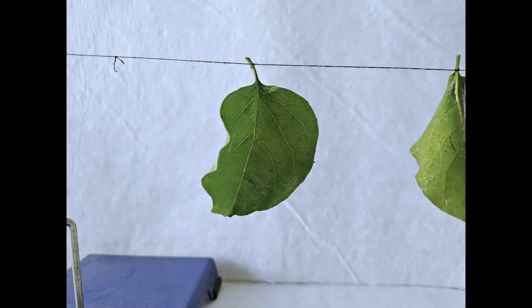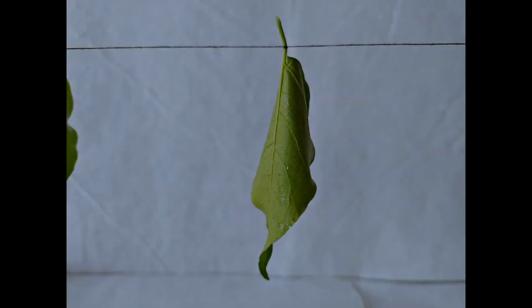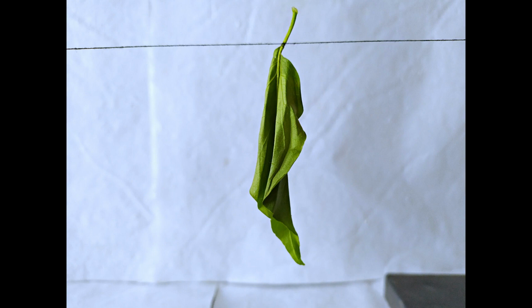The first leaf, with both surfaces greased, hasn't changed much and remains about as fresh as when the setup was placed in sunlight. The second leaf too hasn't changed much except that it has become slightly flaccid. The third leaf, with grease applied on the upper surface, has considerably wilted. And compared to the third leaf, the fourth leaf without any applied grease has wilted to the point that it has become shriveled and almost dry.